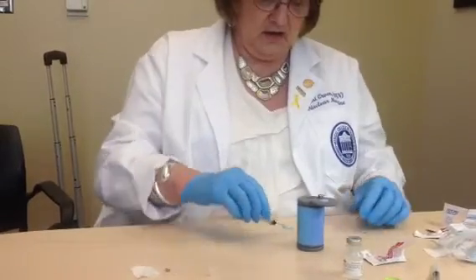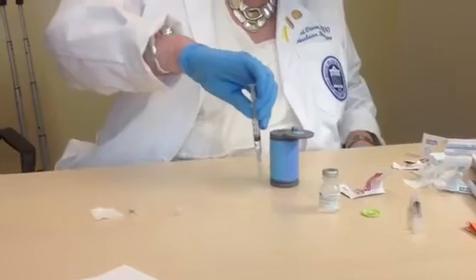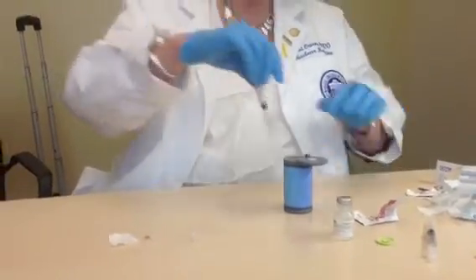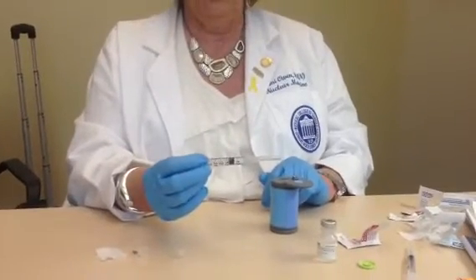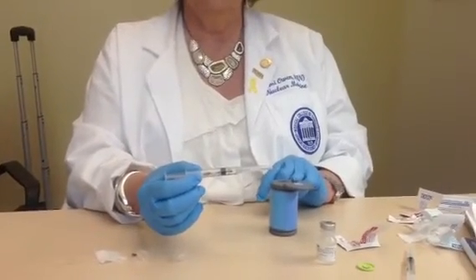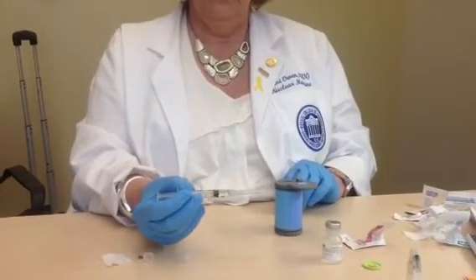I would then actually take this to the dose calibrator to measure the exact amount of the dose, which we hope would be 5 millicuries, based on my calculation of activity and volume. And that would be it.